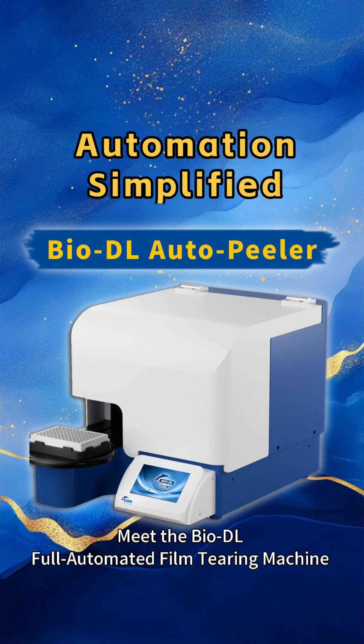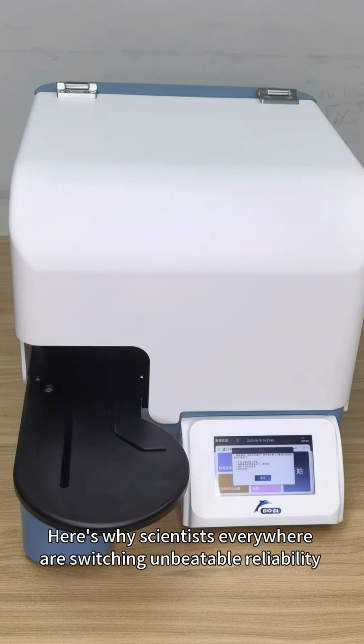Meet the BioDL full automated film tearing machine, the game changer your lab needs. Here's why scientists everywhere are switching.